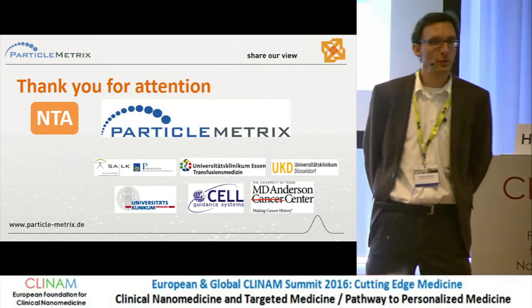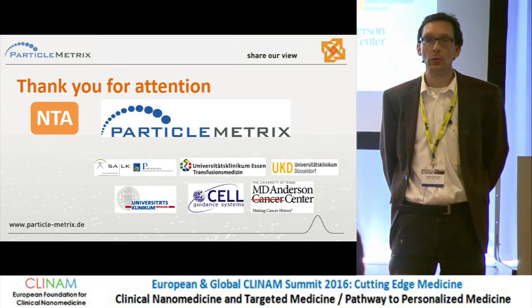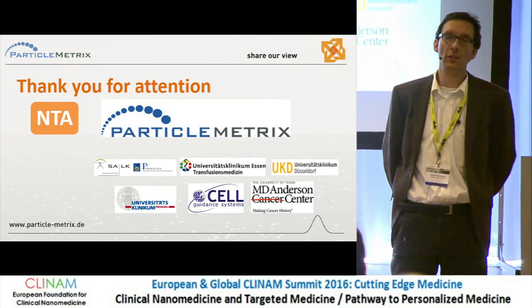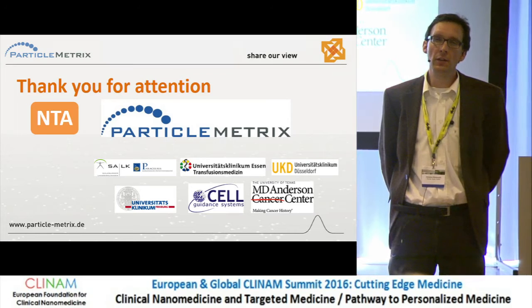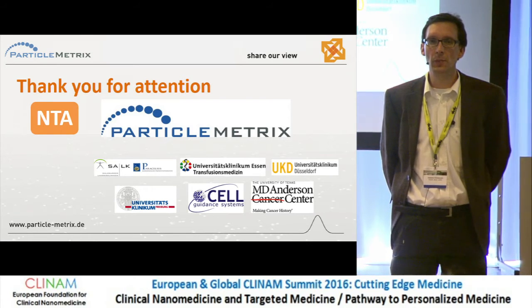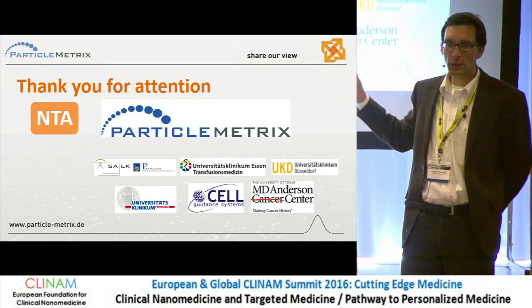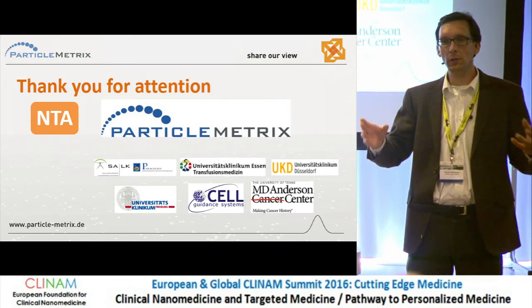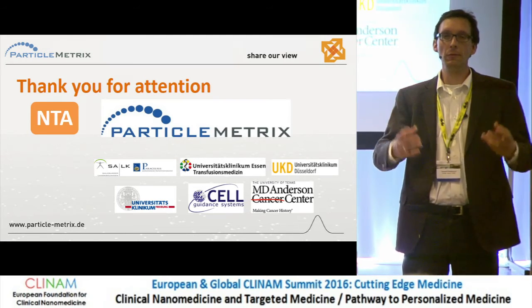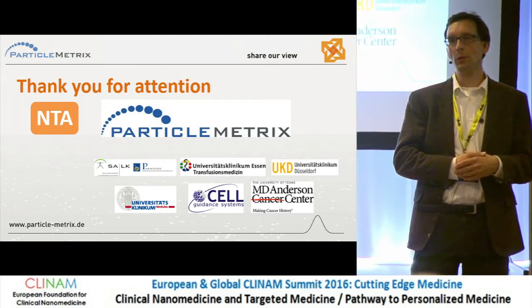Yes, concentration, Zeta potential, fluorescence should not be a problem. It's kind of challenging if it goes to the real size determination, because the approximation we are doing here, we think idealistically it's a sphere. If you know a little bit more, let's say an aspect ratio, if you have a needle, we might be a little bit closer in the approximation of the size. But I would be more than happy to talk in detail, because we use this multi-parameter statistics. We can see the spherical from the non-spherical, which is a first approach. If it comes to more complex, like if you have different sizes, shapes, irregularity can have a lot of dimensions. With a little bit of a priori knowledge, we can go to more detailed answers.